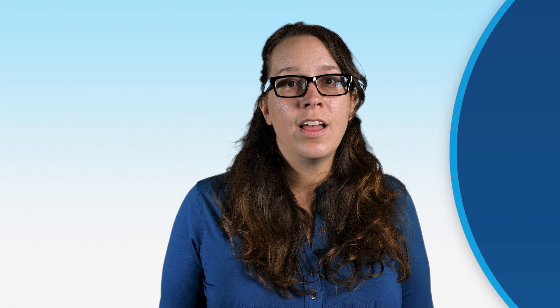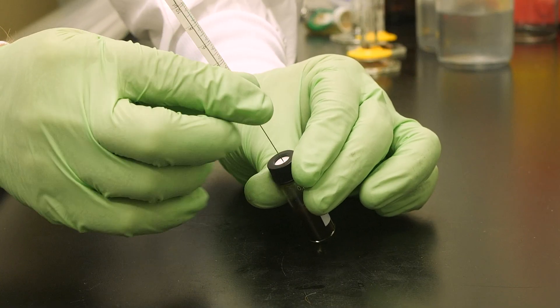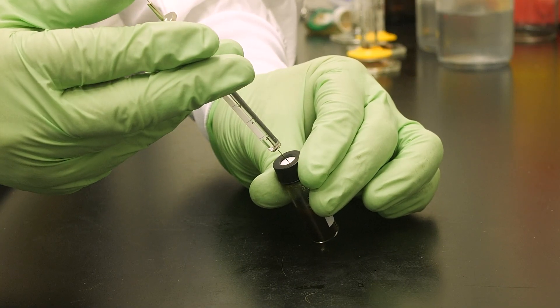Injection technique. While your exact technique can vary depending on your syringe, instrument and use, there are a few things to consider. Always insert the syringe in a slow and steady motion, especially when entering GC septa. Applying too much force can damage the plunger or needle tip.